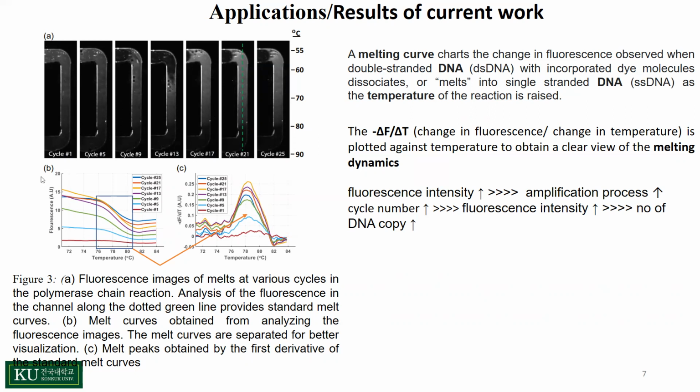Again, from top to bottom, if we go from 55 degrees to 80 degrees, we can see that under cooling conditions the intensity is higher than under heating conditions.